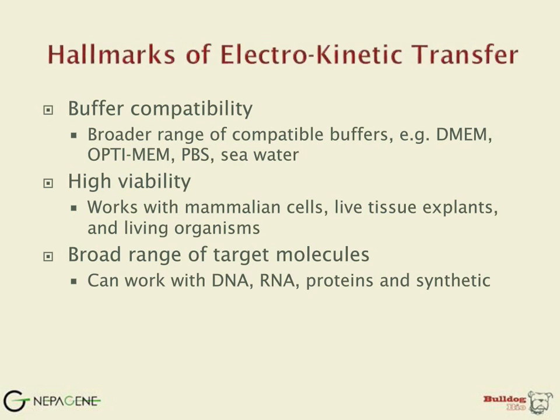More impressive is that the technology of moving charged molecules is easily applied to proteins or synthetic molecules. These molecules do not need to be small. In fact, recently we've had a lab successfully transfect mammalian cells with an artificial chromosome.